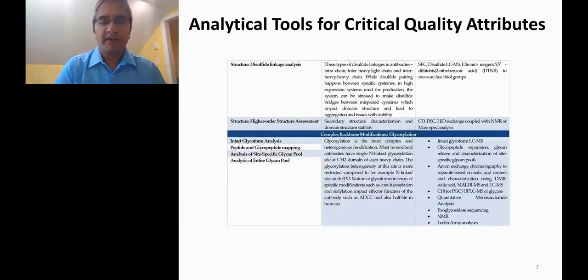So monitoring these glycosylation profiles as a function of both the process and product quality axes becomes very important. Having the right set of tools to develop these correlations is very important from the standpoint of the integrated characterization of these biopharmaceutical products.